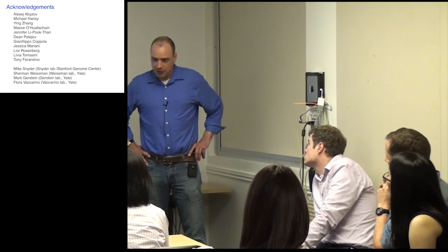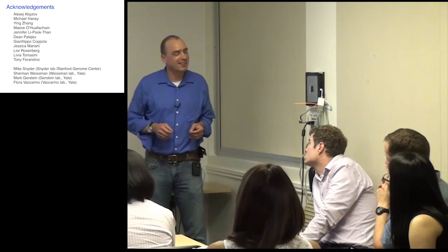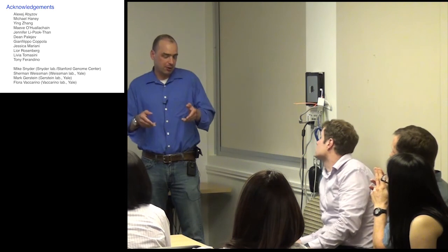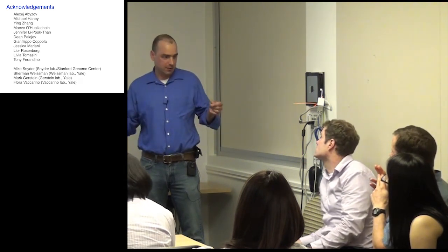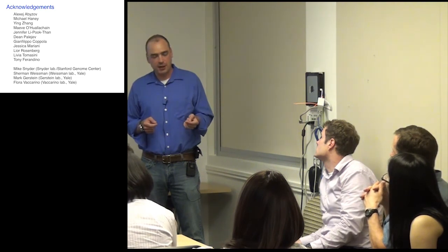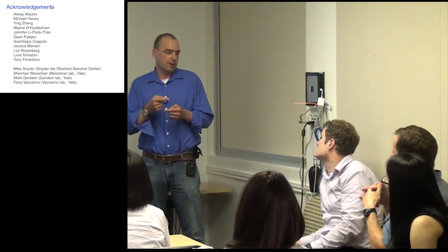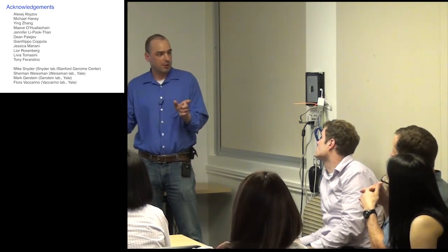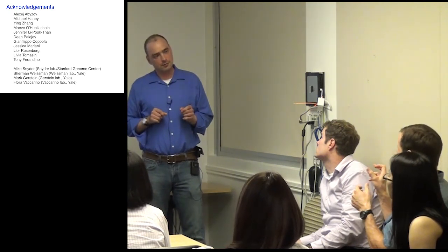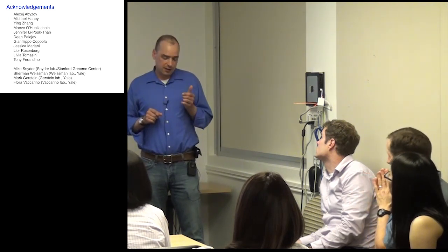So the question is how exactly does a duplicate work. In the deletion cases, that's why I chose the deletion. It was obviously hard enough for me to make this graphic. But in the deletion case, it's relatively easy. Once you have a good enough deletion prediction, you know how to set your PCR parameters. So you're pointing out that if you have a duplication, you just see the upspike in the CNV signal, and you don't know where that extra fragment landed. There should be a chimeric end somewhere, but you wouldn't see that in the read depth mapping.